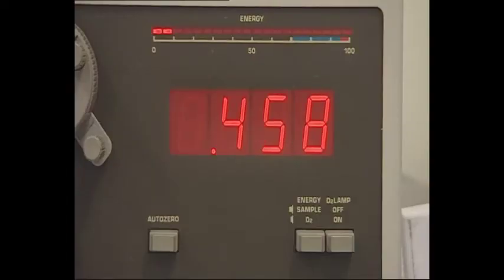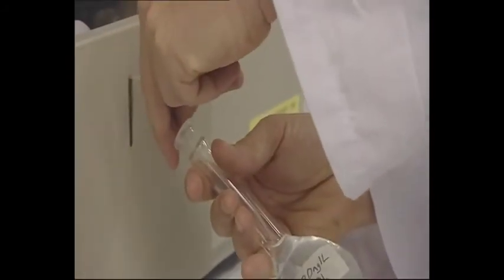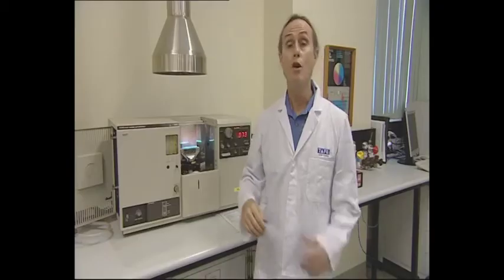The detector records the amount of light emerging from the flame. If we increase the amount of atoms we're analysing in the flame, the amount of light arriving at the detector will decrease and the absorption value will increase. The more of the analyte we have, the greater the absorbance value.